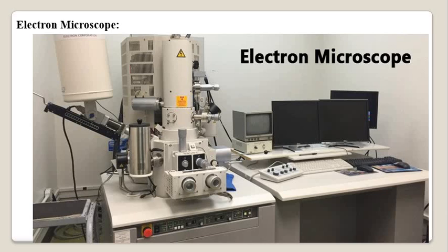The simple, compound and electron microscope have a similar arrangement. So they have three main systems: the illumination system, the magnification system, and the observation or optical system, that is, the magnified image system.